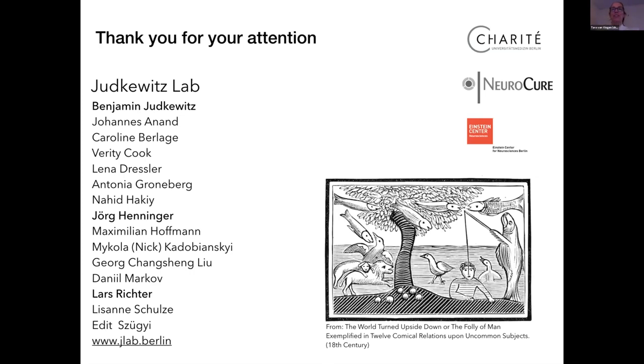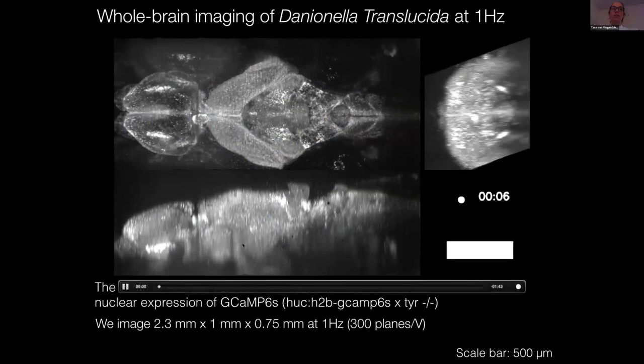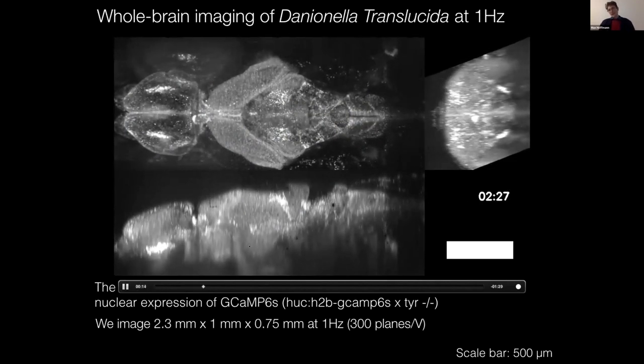Question: I don't know very much about translucent fish — what is happening in that video where you see the fish kind of moving? The fish are embedded in an agarose matrix; they are awake and not paralyzed. Sometimes during the recording, the fish basically twitch. The movement is so strong that even though the videos are motion-corrected, those movements are so fast that you cannot actually correct for them. When analyzing those recordings, we would just exclude those frames.